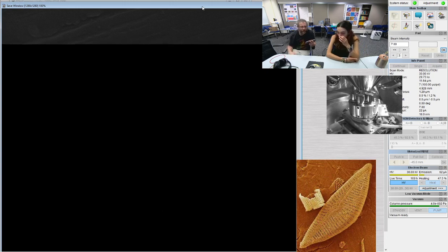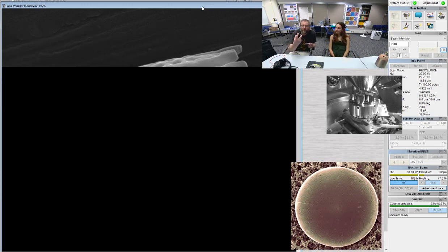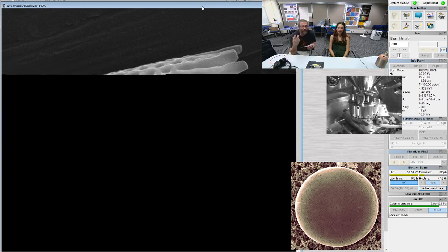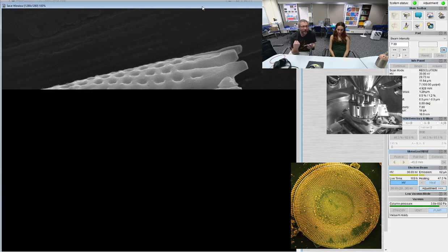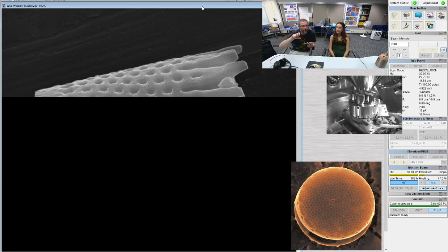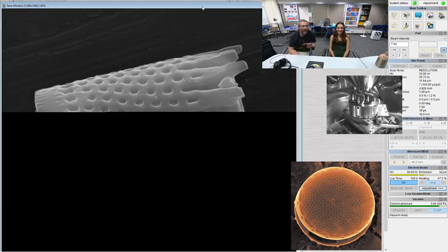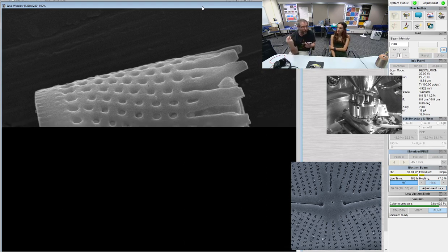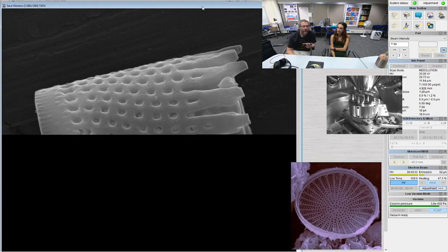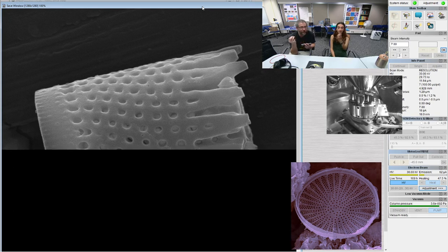How do you stigmate properly? Just based on image blurriness? No, it's basically just micro-focusing. What you want to find is something perfectly circular, because if it stigmates correctly, it will stay perfectly circular. But also, you can maximize the contrast when you're trying to focus something. When it's in peak focus, it'll also have peak contrast. So if you have something little with a bunch of little holes, smaller than what we have here even, like the cribra on the inside of a diatom, that's usually a good thing to pick at, because it's small, it's perfectly circular, and it's got a whole bunch of little holes inside of it. So you can get the maximum contrast easily, and then you can get the tiny pores in focus using just micro-focusing.